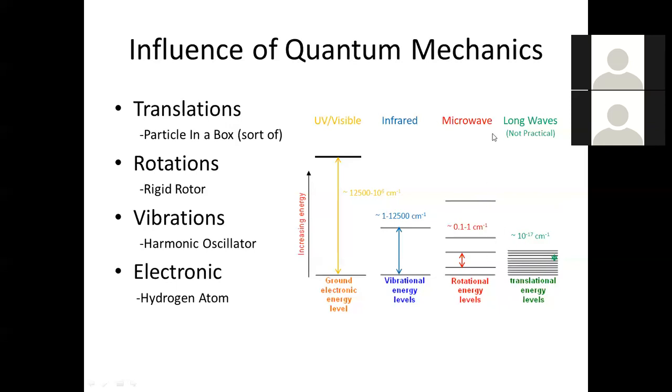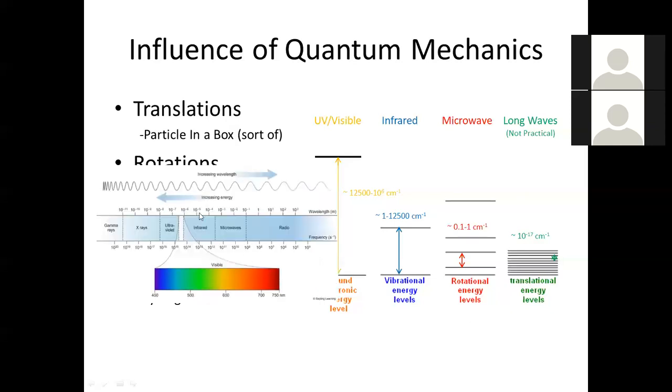But where do these spin flips that we were talking about earlier fall into these? Well, we're missing part of the electromagnetic spectrum as we go on here, and the big portion here is radio waves. So radio waves would go in the middle here, and those are the frequencies that we would need to actually excite spin flips in nuclei. So what do I mean by exciting a spin flip? Because if you think about it, a spin 1/2 system, this is sort of your picture. You could have an up spin or a down spin, right? And they have the same energy. There's no difference, no preference or anything like that, right?